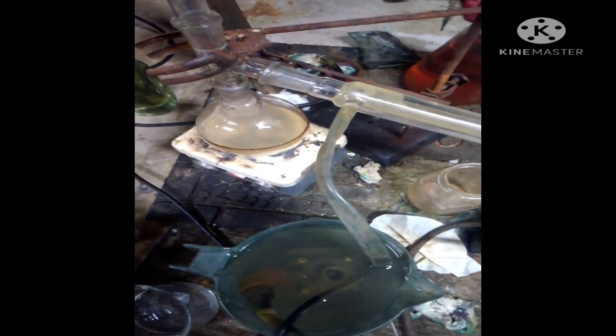I got it all filtered and put back together and now I'm going to distill it. The only thing in there is the Everclear — well, there was sodium hydroxide but now that's removed — so it's just the Everclear in the boiling flask. It's going to distill over, and then once I'm done distilling I'm going to add the glacial acetic acid.